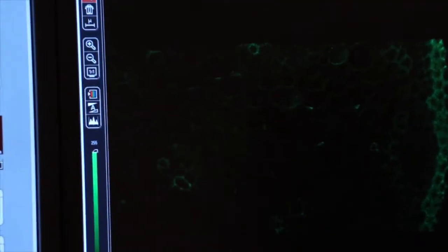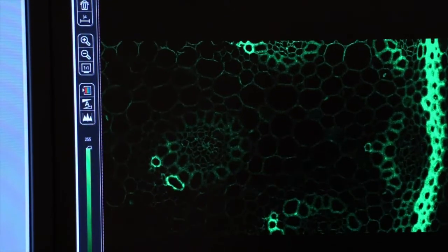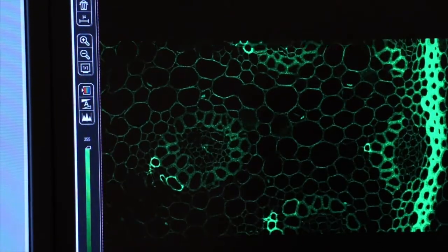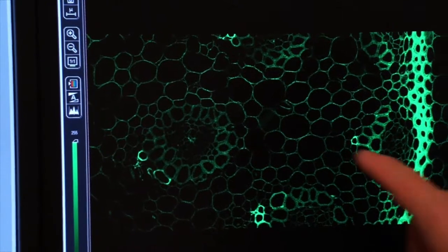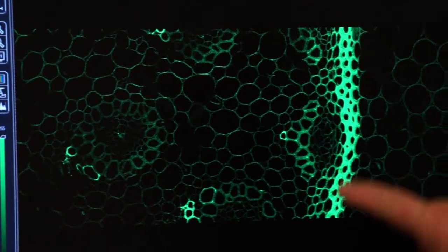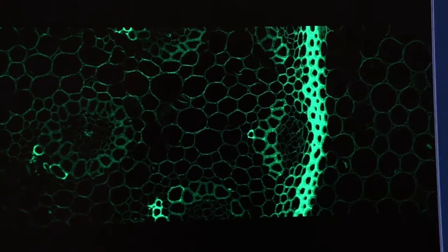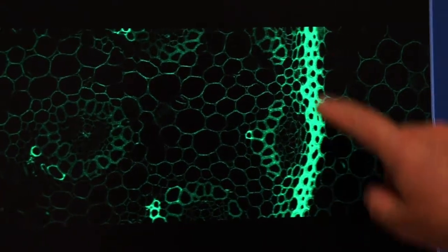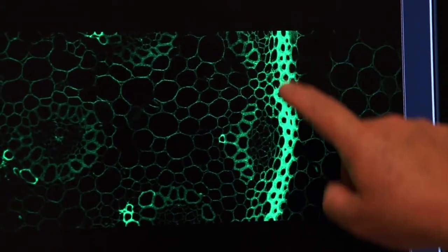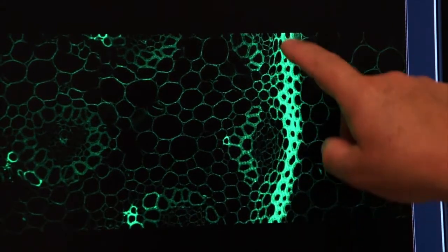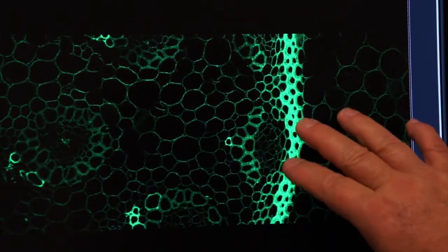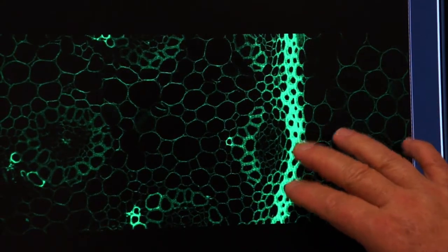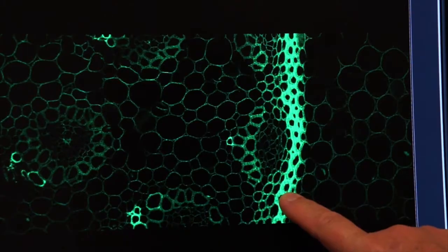And so it's always important to make sure that my focus is properly set. So I'm refocusing now and you can see that the finer lines are becoming nice and sharp, but I'm getting a little brightness here, which may be indicative of my laser power. Maybe my laser power is a little too high. And remember that I want to keep the laser power as low as possible to minimize photobleaching.